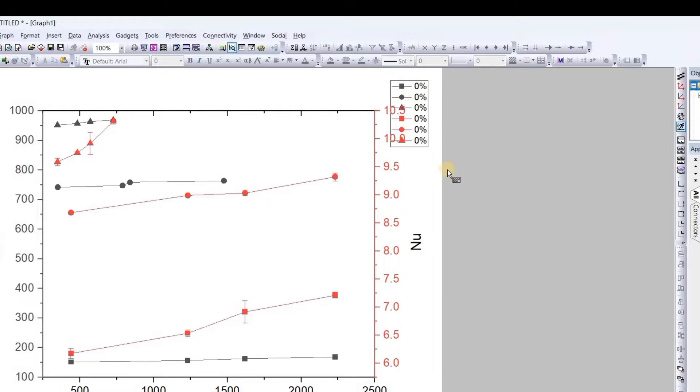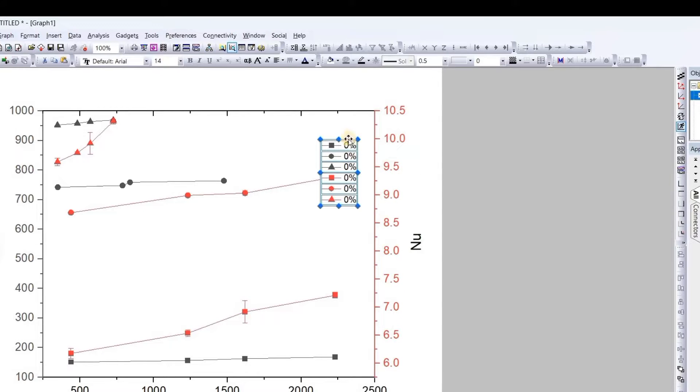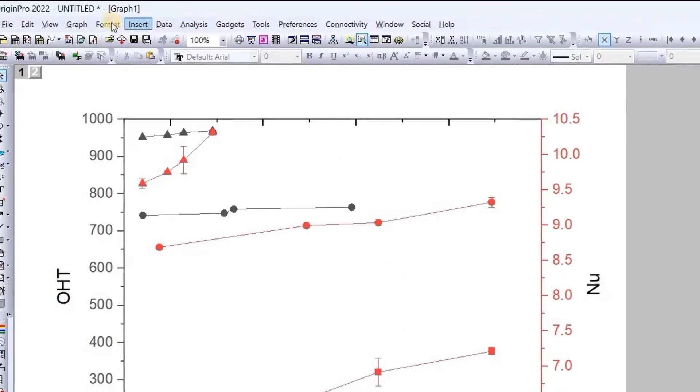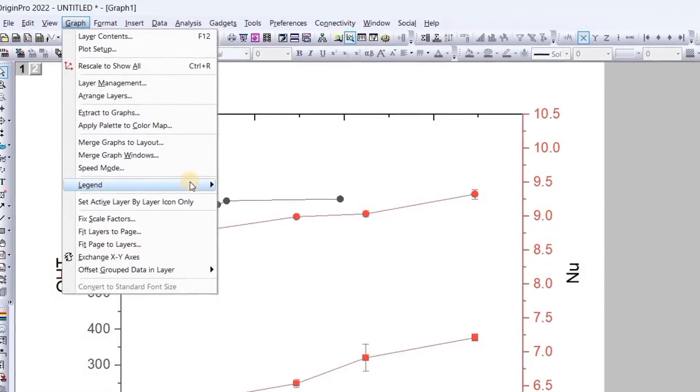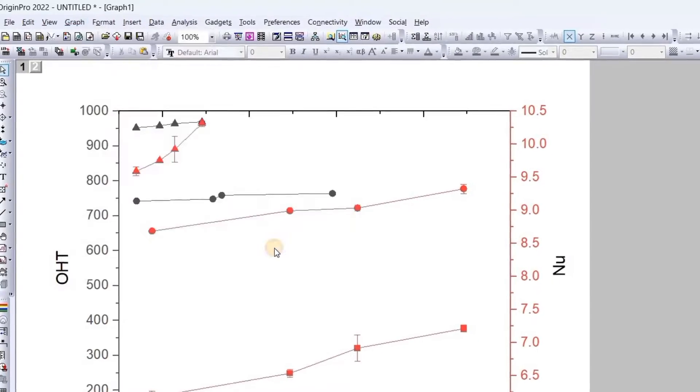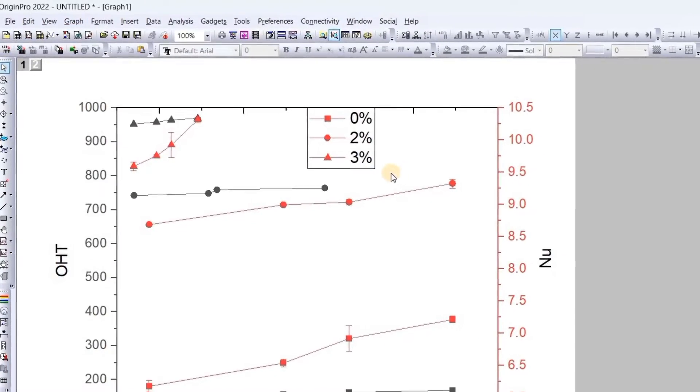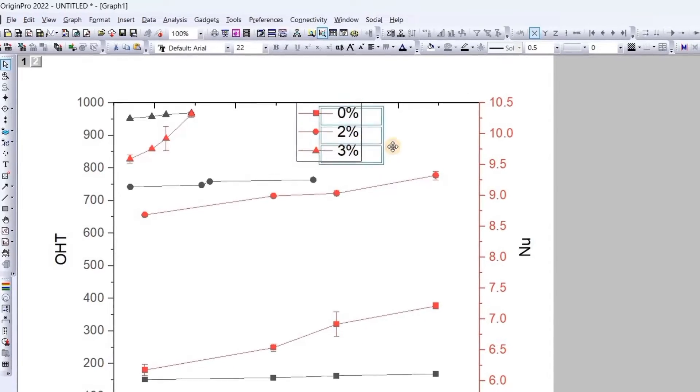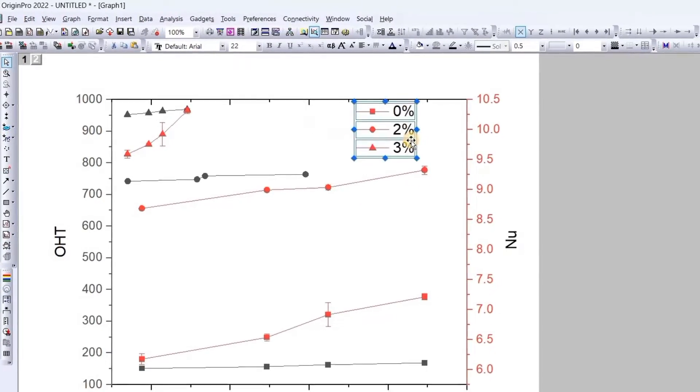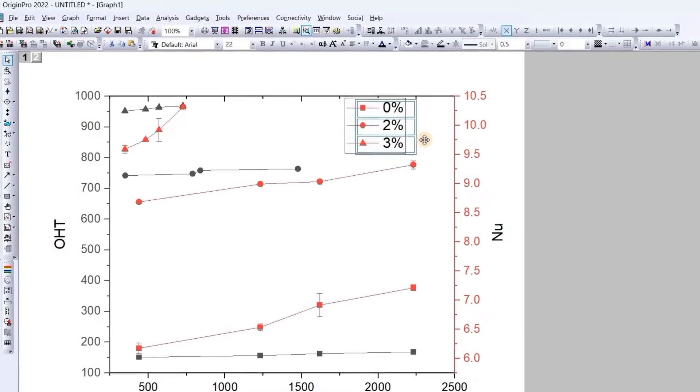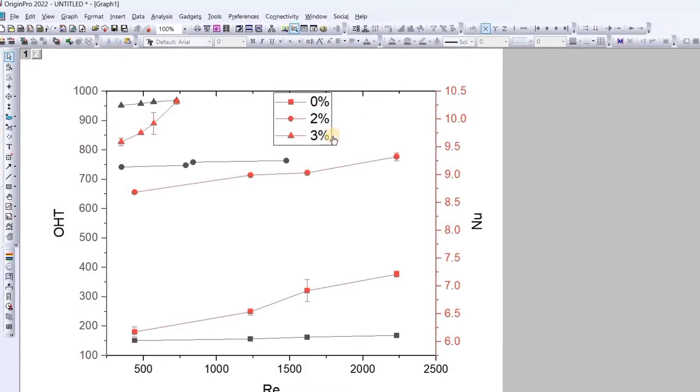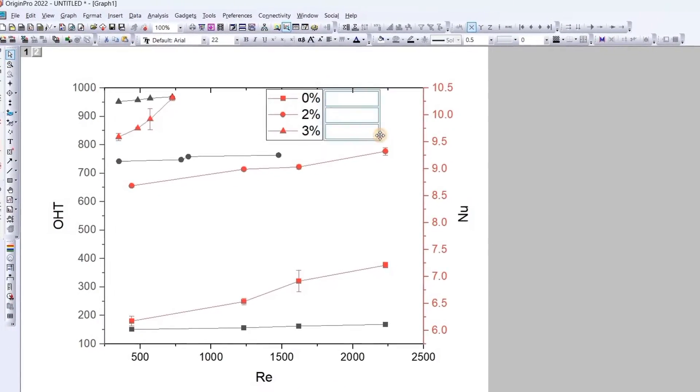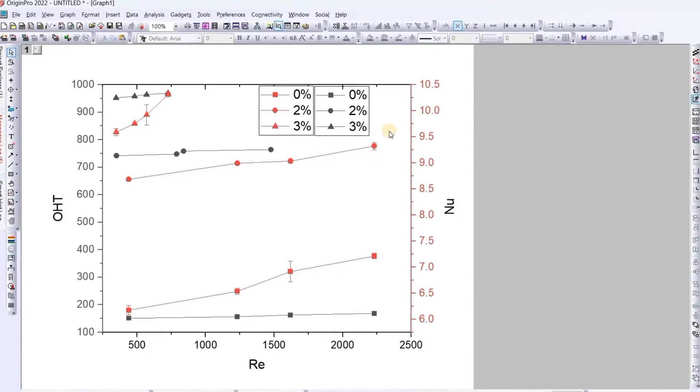Now we will apply it and close it. As now we can see here, the graph has been plotted perfectly. But we can see in the legend, something has gone wrong. So we will delete it.